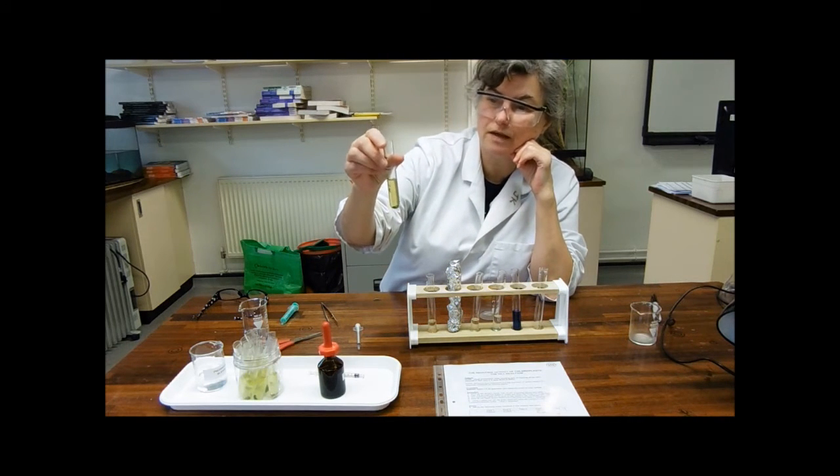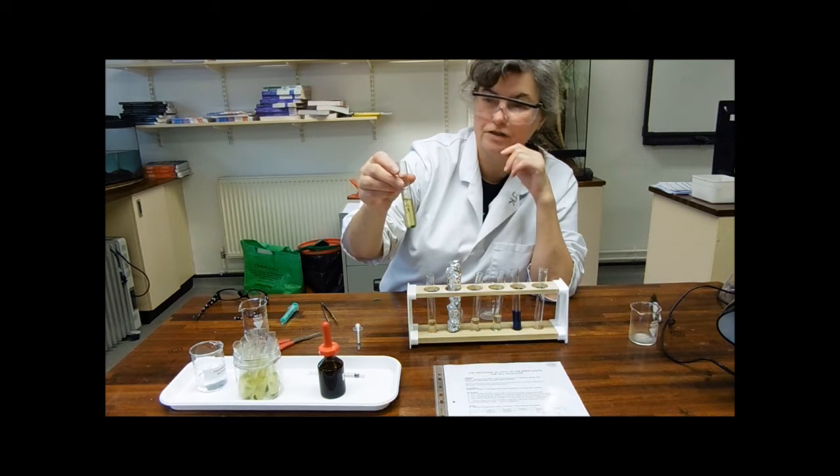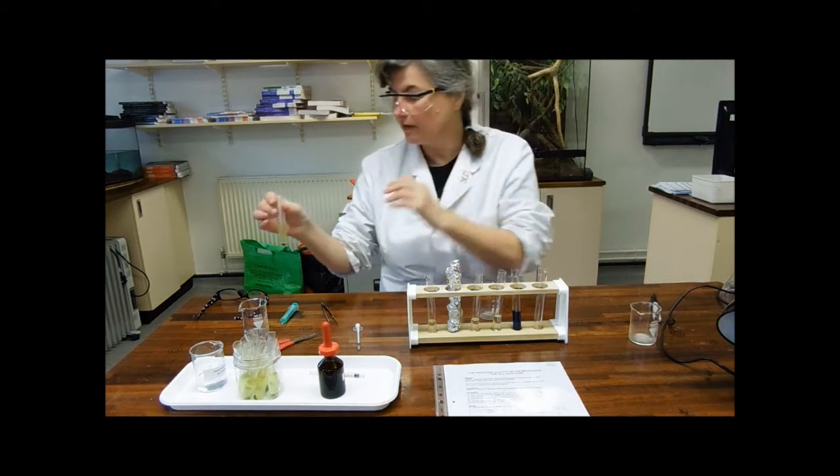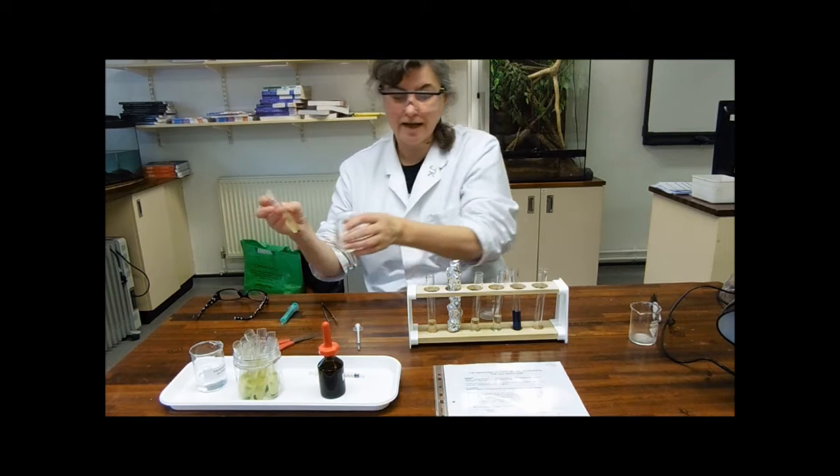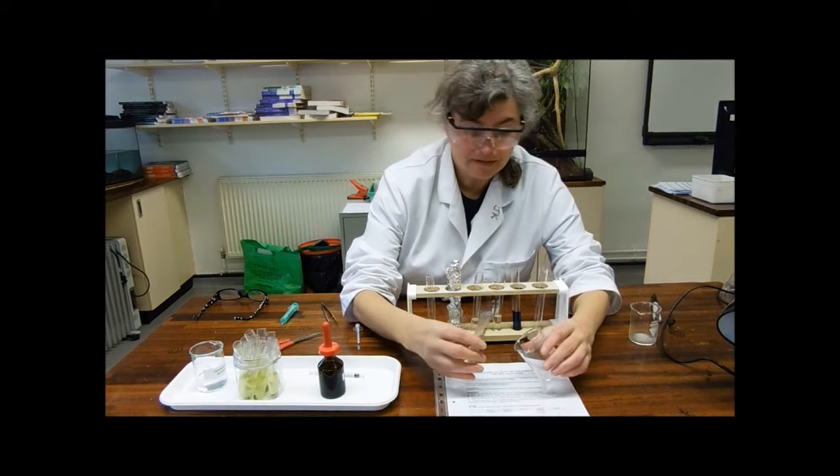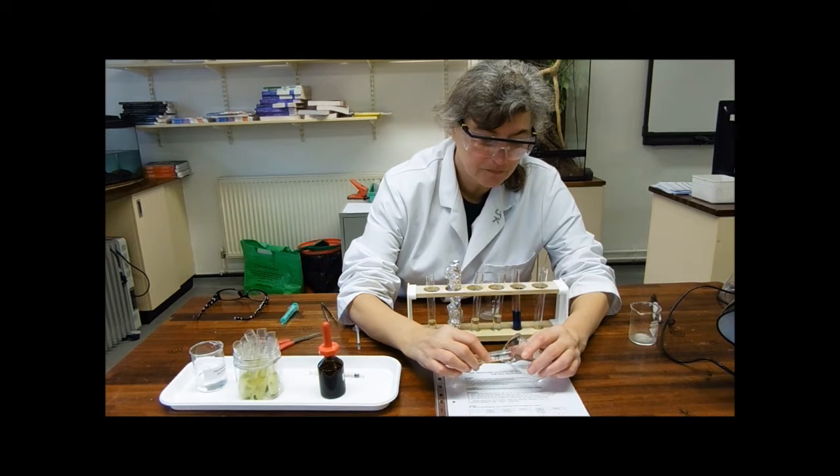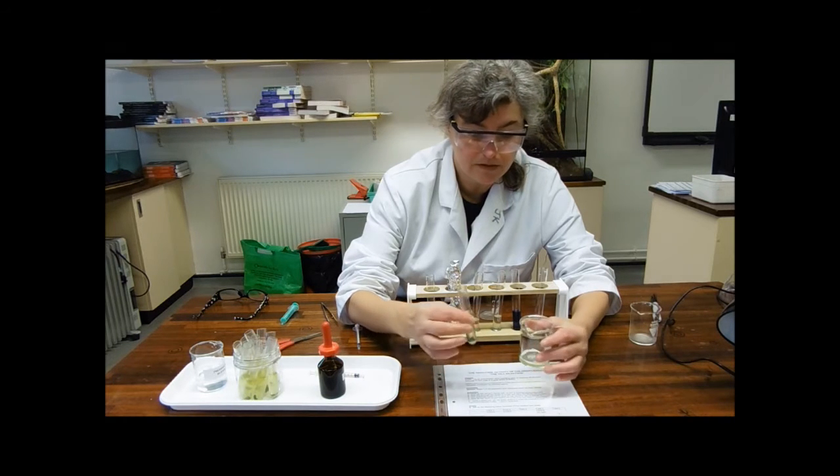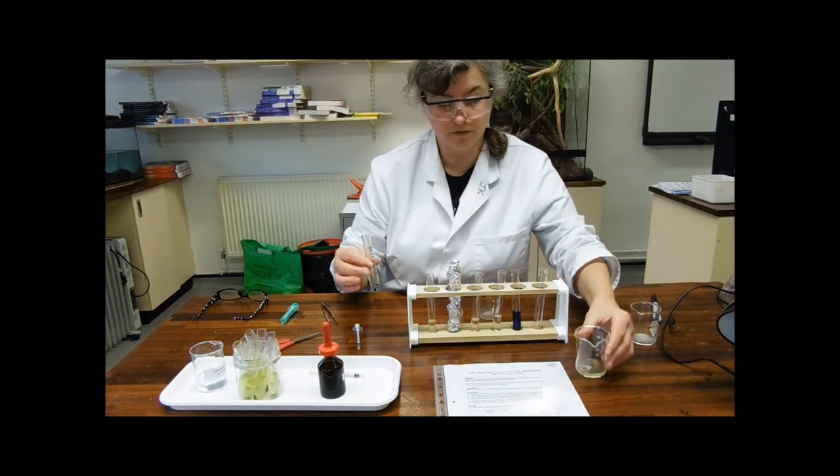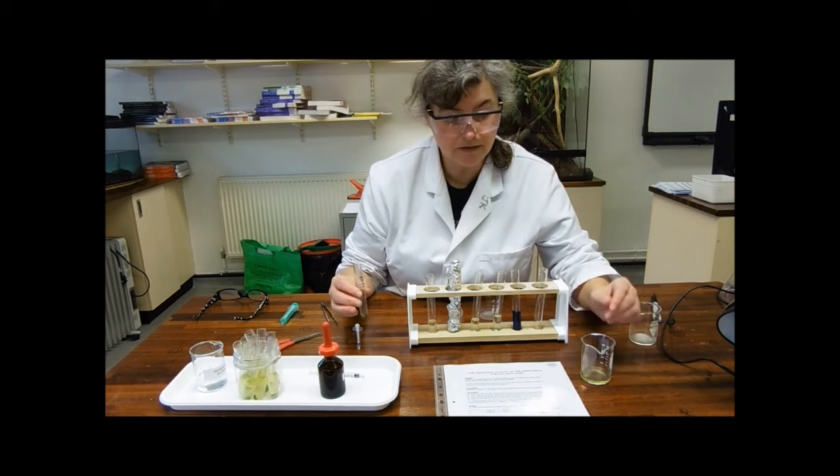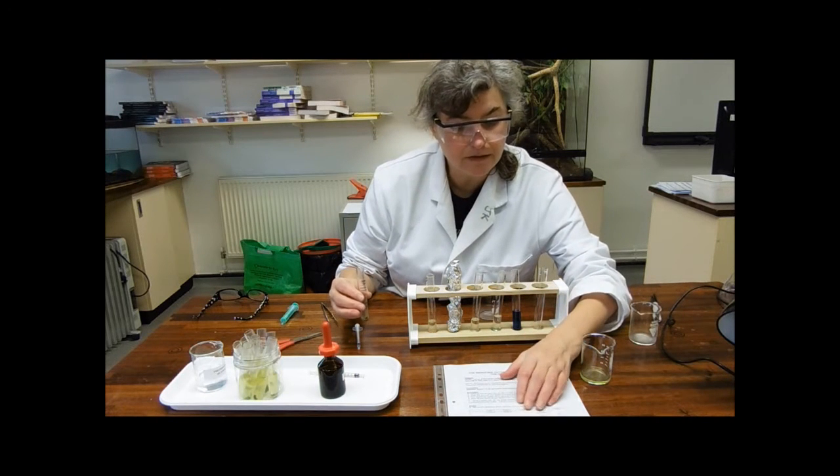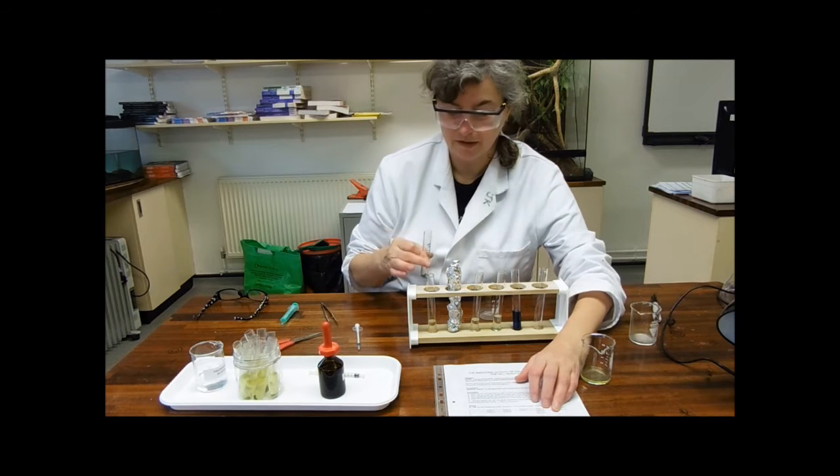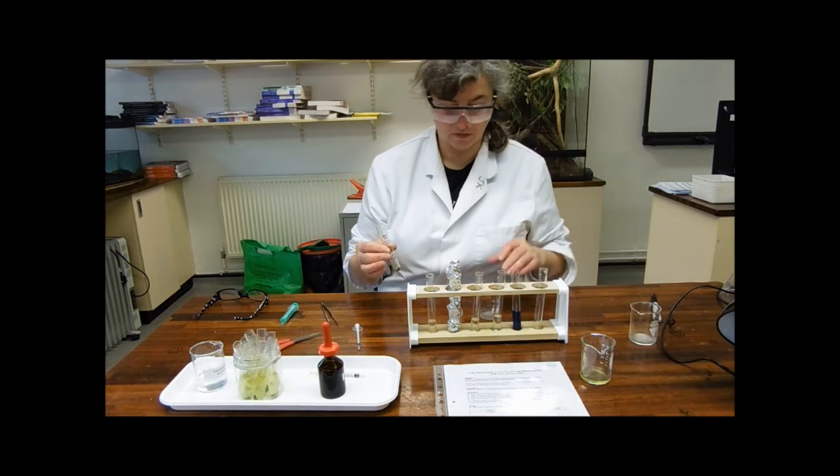Some of the smaller chloroplasts have ended up in what's called the supernatant. So I'm just going to drain off very carefully the supernatant. This is only going to have a few chloroplasts and we are going to use that in one of the tubes. In tube five, I'm going to need one centimeter of supernatant.